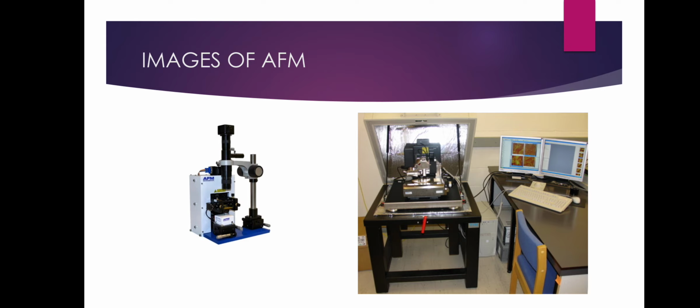Whatever data we get by following the process of AFM is transferred to the electronic device, and there we get to see the topographic or 3D image of the sample surface. An AFM is very expensive.